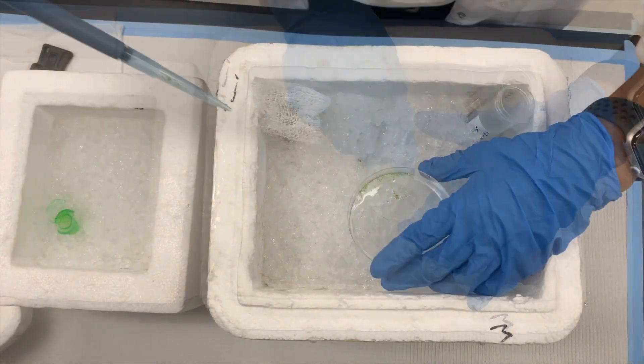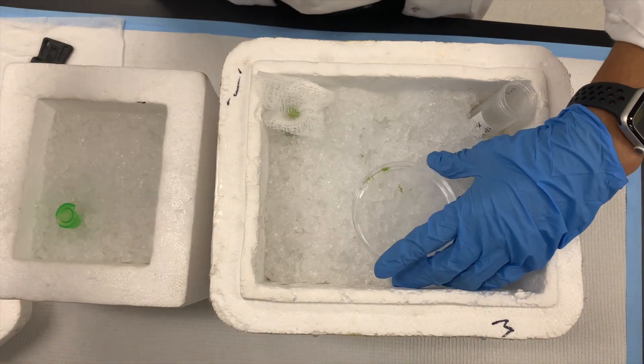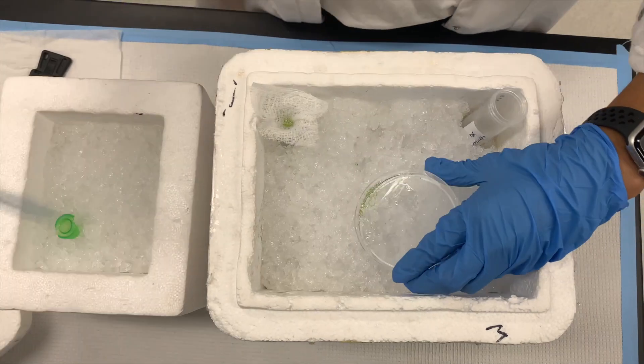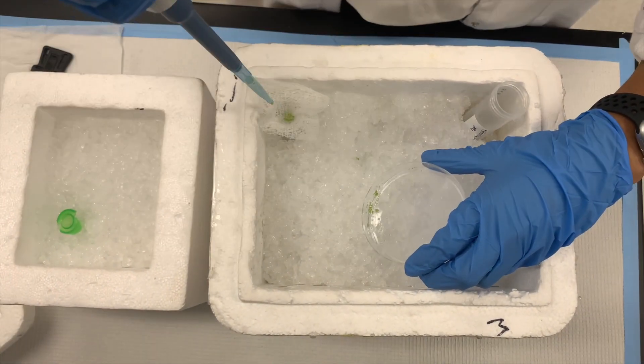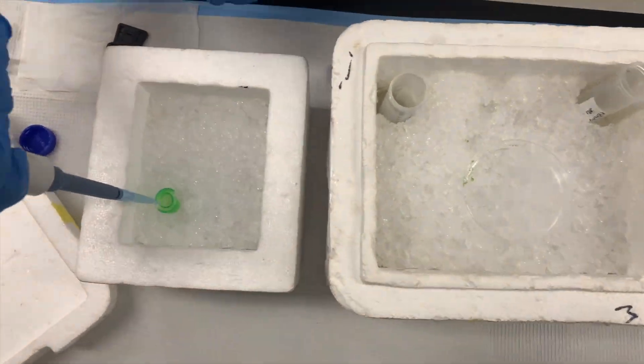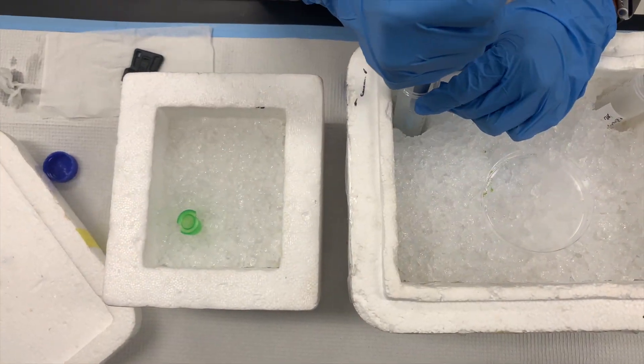Once you chop it up, you draw it with a cut pipette tip. You filter it through the cheesecloth. You wash the petri dish with the other half of the buffer, and you draw it up again through cheesecloth. Then this final homogenate in the falcon tube, you filter it through the cell strainer.